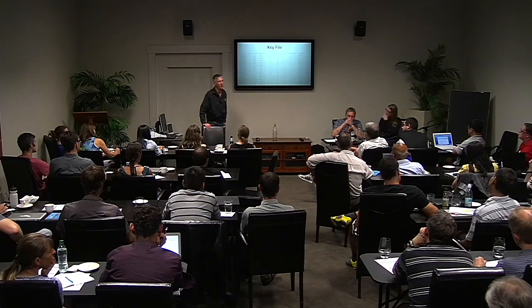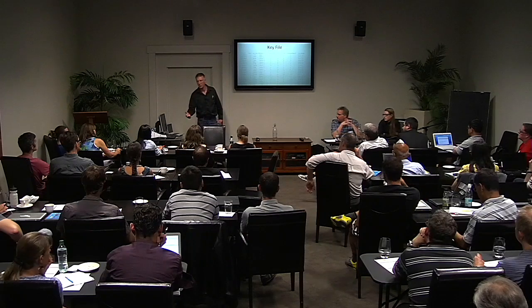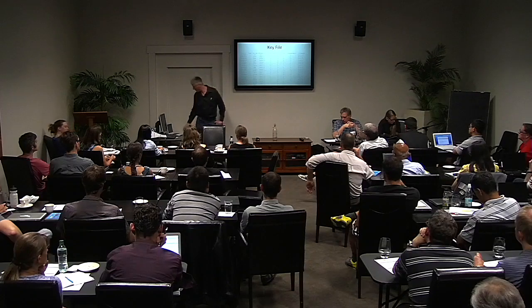So Katie's just illustrated another use for GBS as a diagnostic, right? You can use this tool to check to see if what you have is what you think you have, and that's a good way to do it.